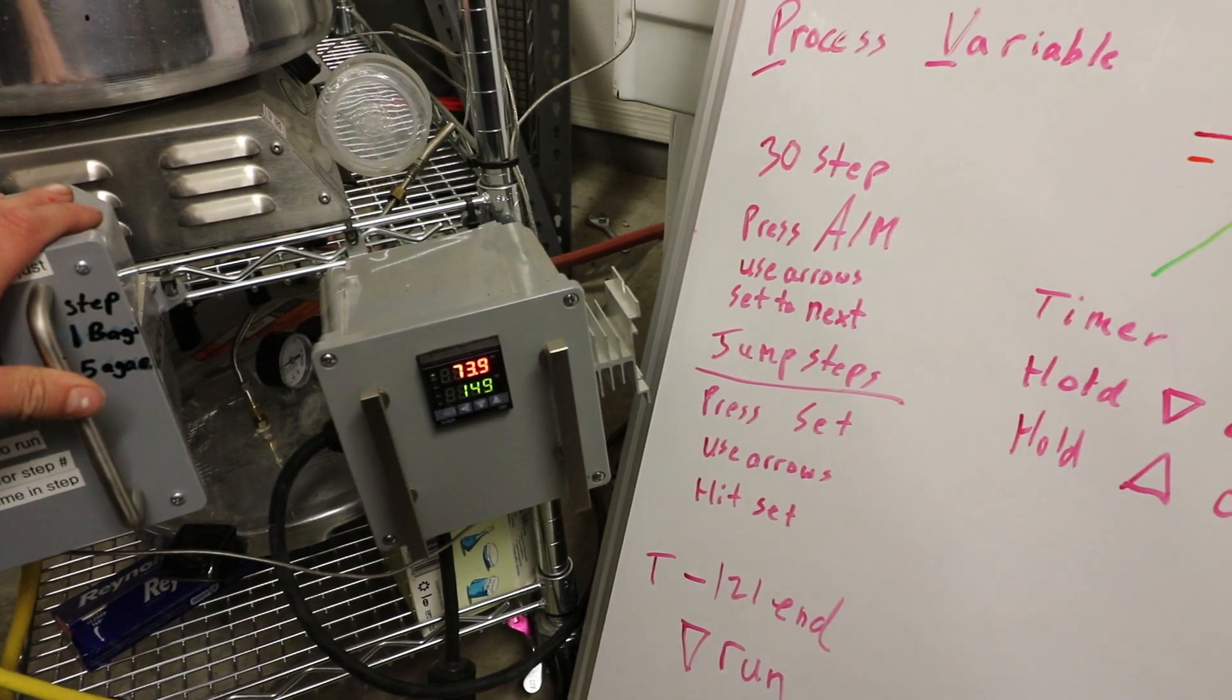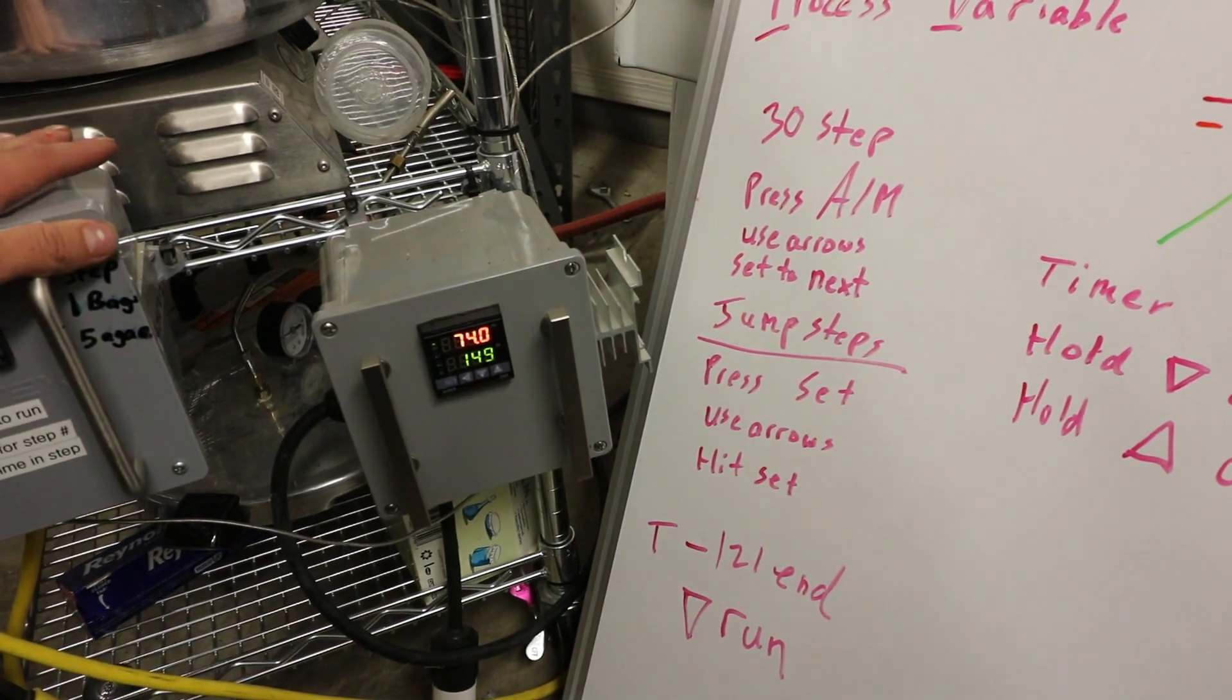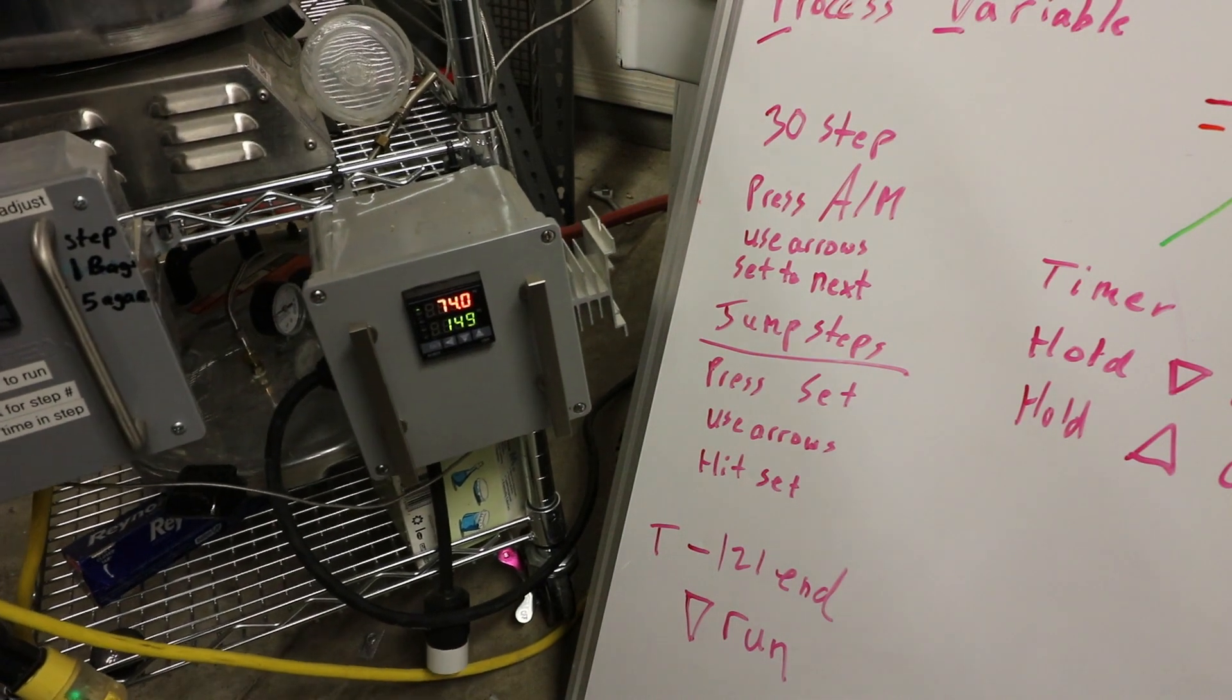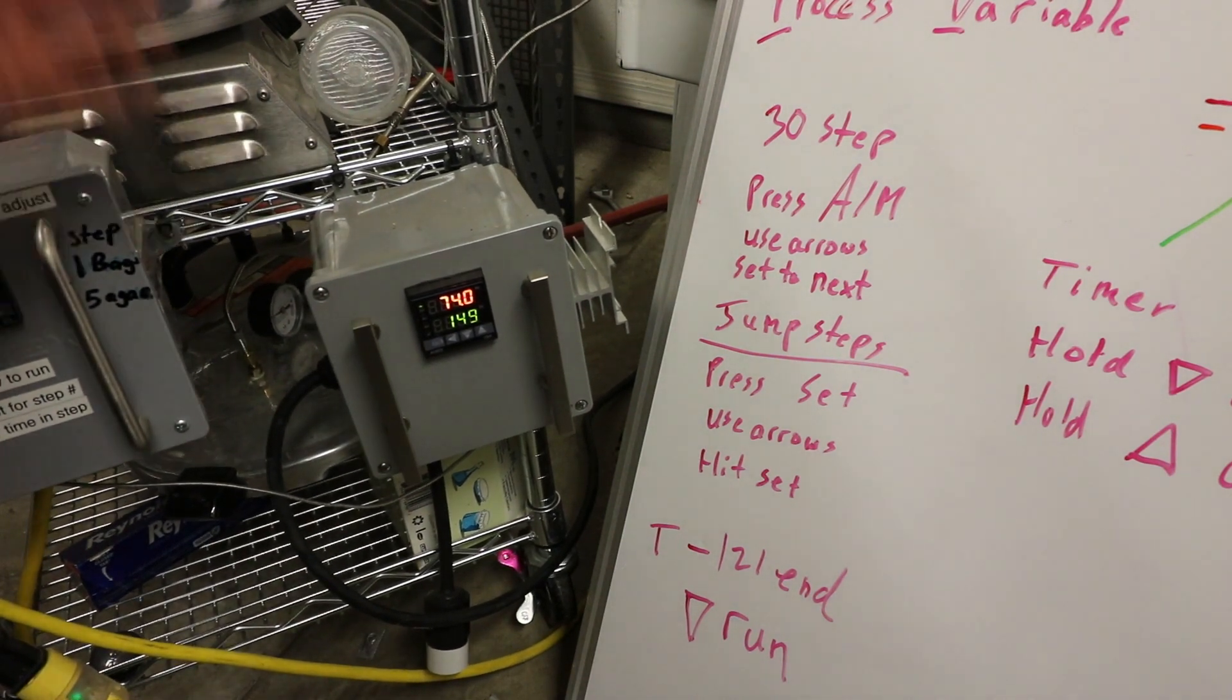So then moving on to the timer one, which is much simpler. I probably should have started with it first. This one, it only has two different settings: time and temperature.